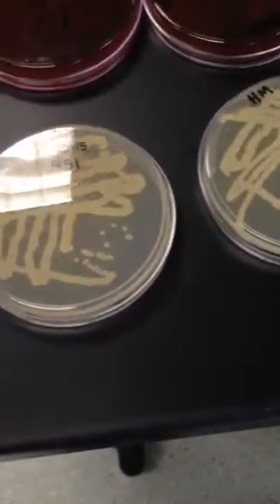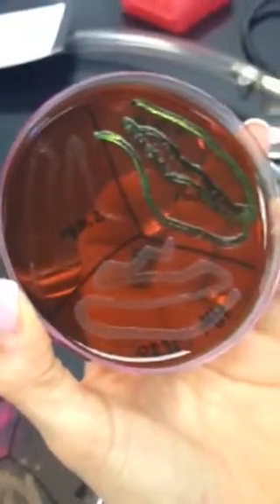Okay, the EMB agar over here stands for eosin methylene blue. The eosin and methylene dyes harm gram-positive. So it selects for gram-negative and against gram-positive. So do you think your S. epi is going to grow on it? Absolutely not. It's gram-positive. The other two can grow on it because they're gram-negative. It specifically selects for enteric bacteria. And there's lactose in it, which supports some enteric bacteria like your fecal coliforms. Who is a fecal coliform? E. coli.